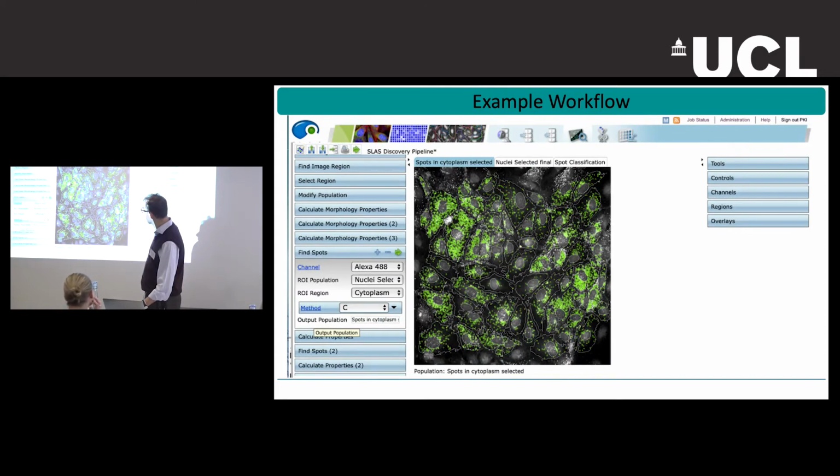And then we wanted to know, I told you before, that the green dots that you see in the initial image were activated Notch. Despite this image being a little bit crowded, it's interesting to see how we detect these features. We detected the little dots, and this is a decision you take beforehand. You know your images, you know your biological data, and you know that Notch can be in the nucleus, in the cytoplasm, the activated ones, or nowhere, simply because the cell is not Notch active, let's say. In the previous work, we decided to categorize the cells that we were finding in 3 categories.